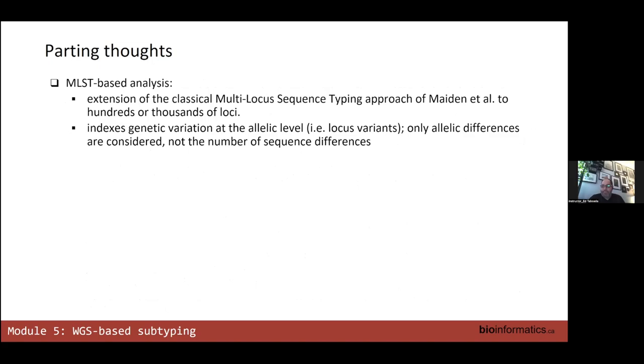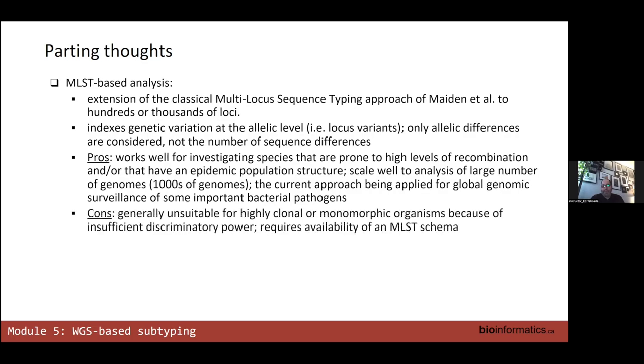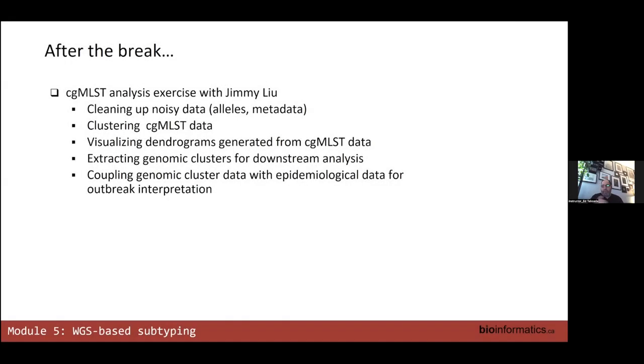MLST analysis, it saddens me that I'm here defending them because I never liked them in the first place. But here we are. It works well for scale up because it's fairly robust. But at the same time, it doesn't have enough resolution for drilling down into some cases, such as some complicated outbreaks where maybe there's not a lot of genetic variability. So they generally have to be supplemented with things like SNP analysis or higher levels of MLST.